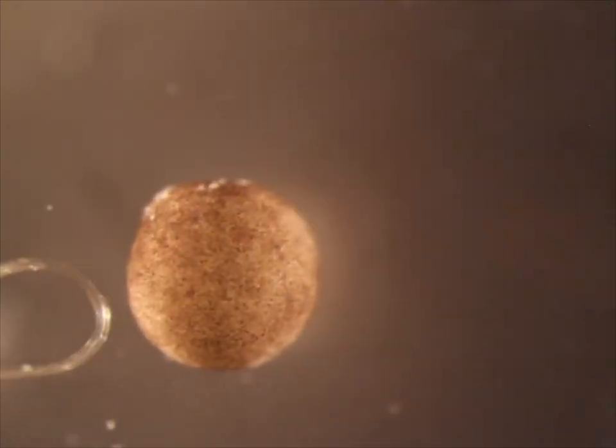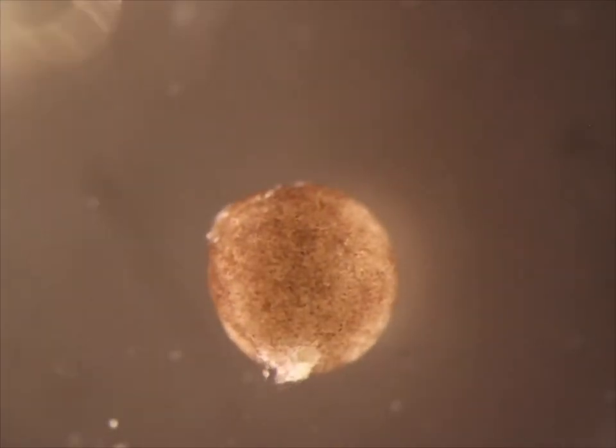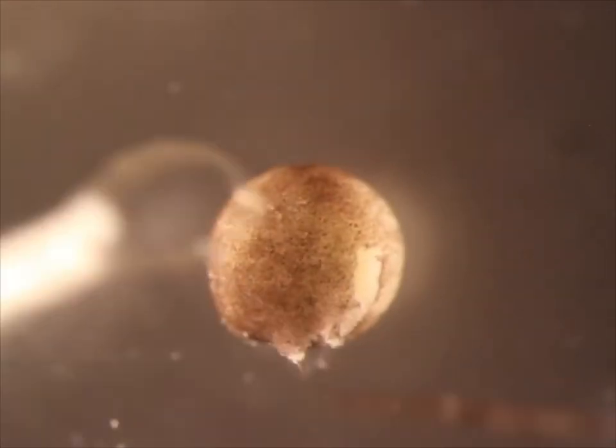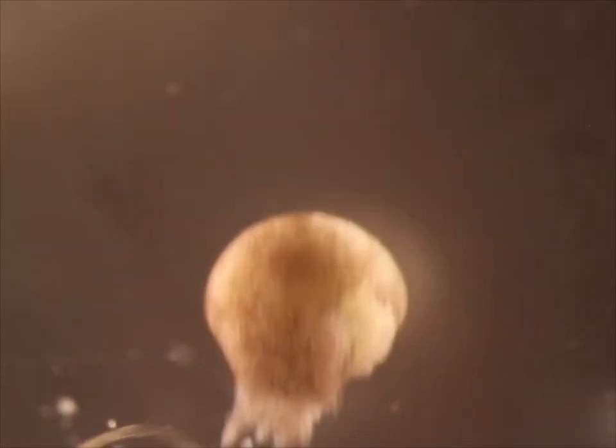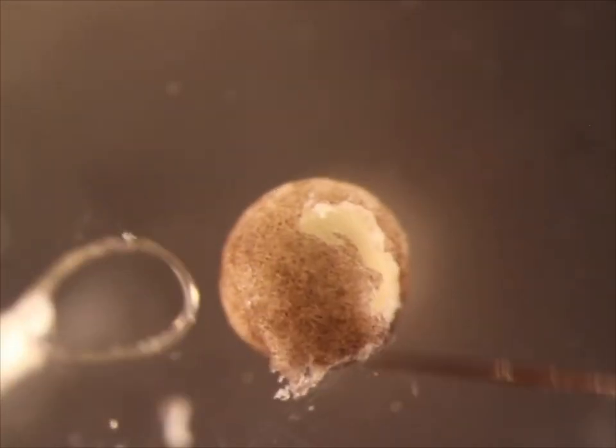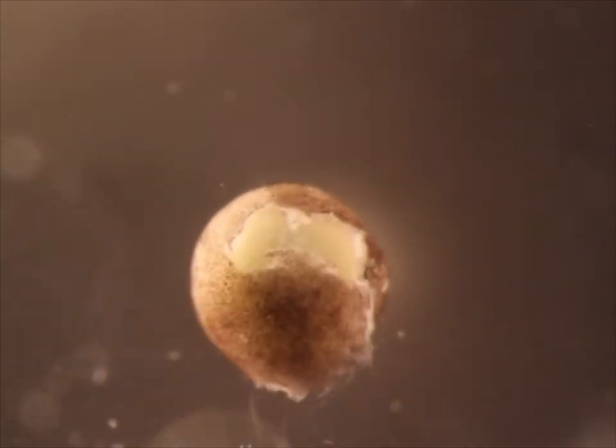Once you have isolated an embryo, you are ready to cut. The hair loop is used to stabilize the embryo while the eyebrow knife cuts the tissue in a motion similar to that of a needle going through fabric. Only small sections should be cut at a time, the motion repeated until the top pigmented portion has been separated from the rest of the embryo.